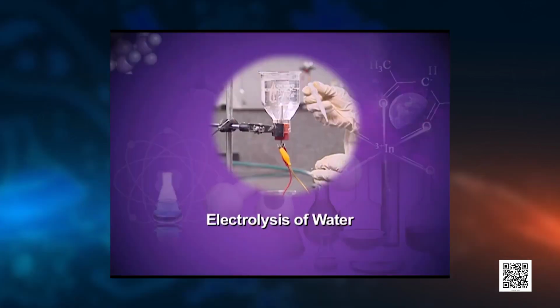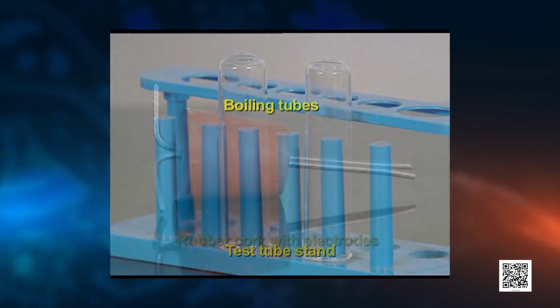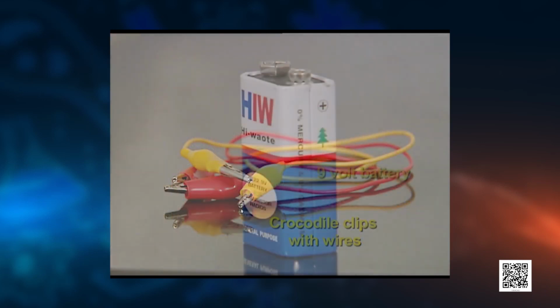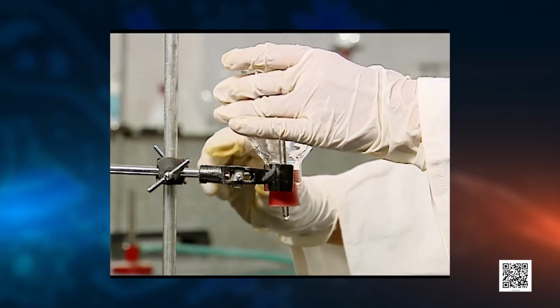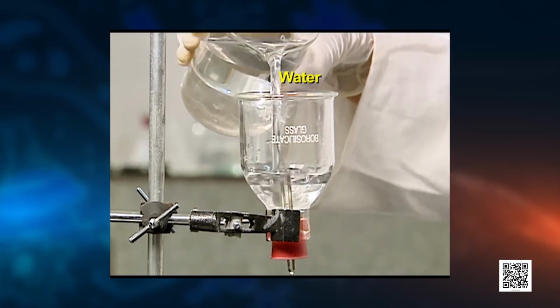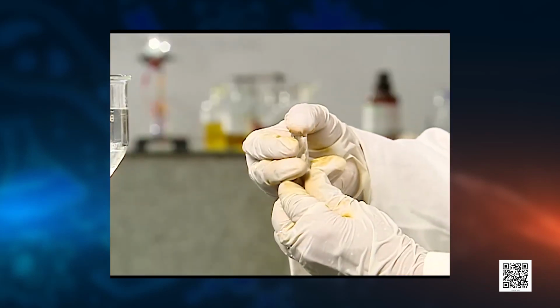Let's watch this video. What's happening in this video? For this experiment, the materials required are a stand, a bell jar, boiling tubes, a rubber cork fitted with 2 electrodes, crocodile clips with wires, and a 9-volt battery. Here, the bell jar has been shown with the rubber cork fitted with 2 electrodes. First, we have to fill water in the bell jar. When we put water in the bell jar, care should be taken that the electrodes are immersed in it properly.